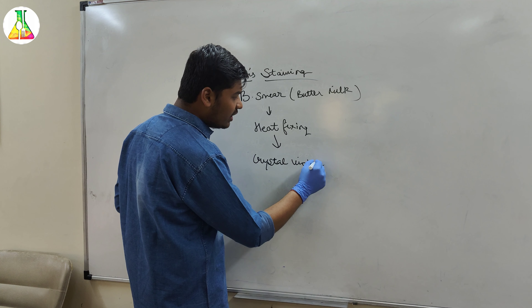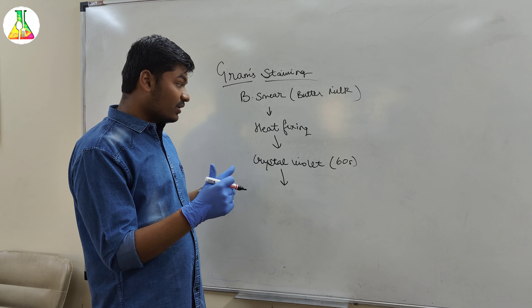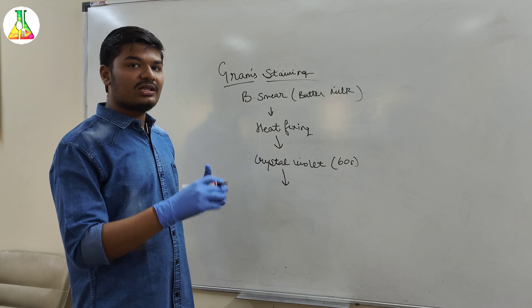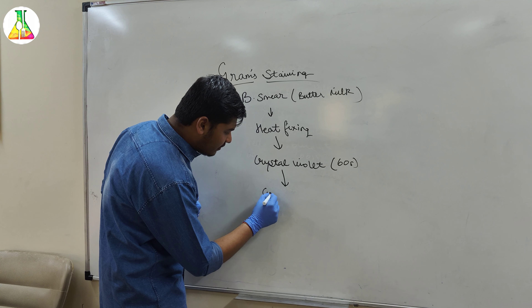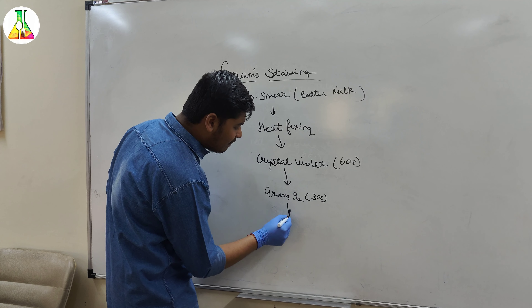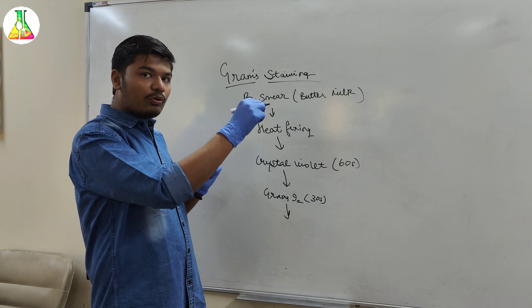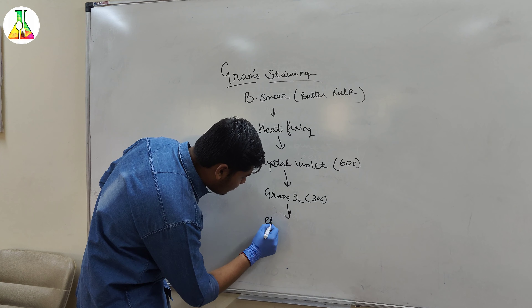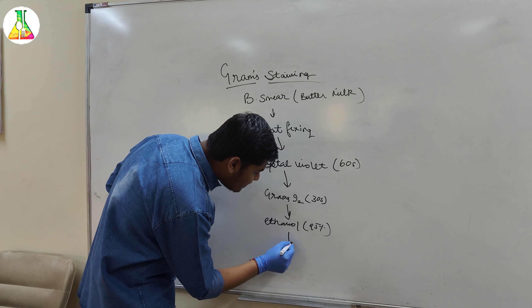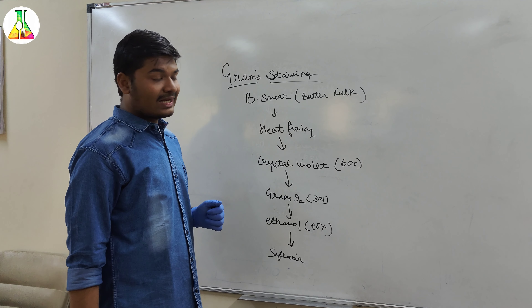After 30 seconds we will wash it and dip it in 95% ethanol for 10 seconds. After that we just need to give it a gentle wash. After this we are going to add the safranin, that is our secondary dye, and let it flood for around 60 seconds. Now after 60 seconds we will again give it a gentle wash and blot dry it.